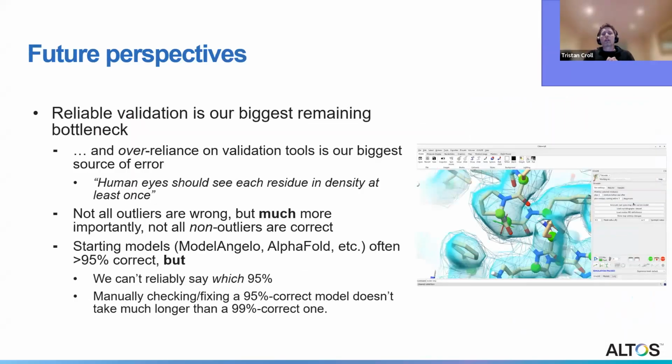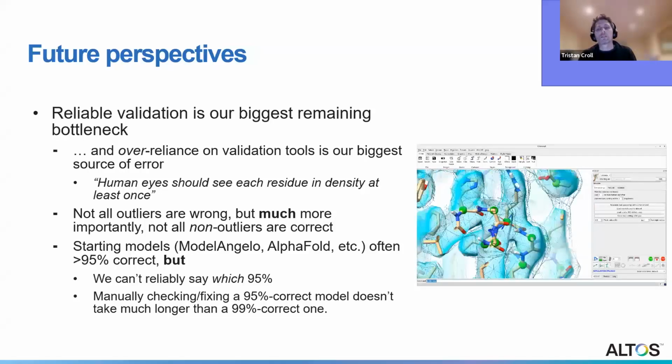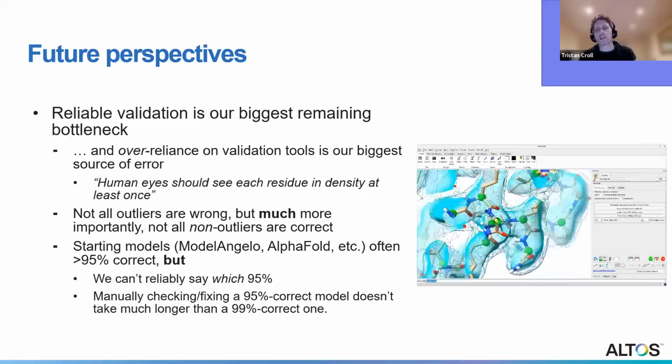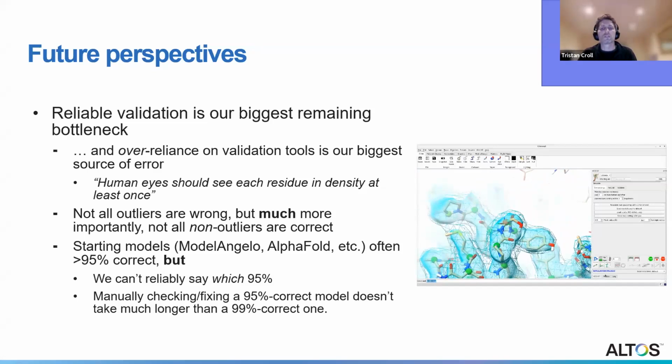But ultimately, I think our biggest bottleneck right now, and if I was going to start a new project today in computational structural biology, I personally wouldn't be going for improved automatic building right now, because I don't think that's the bottleneck anymore. We're hitting the point of diminishing returns there, because what I find more and more is that I spend so much of my time doing essentially this: scrolling end-to-end through a model past the 90 to 95% of residues that are perfectly good to find the one or two that are wrong and fix them.